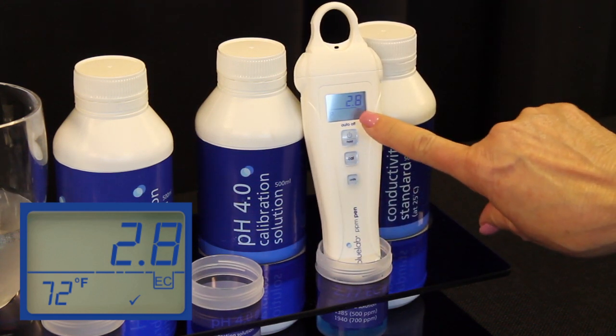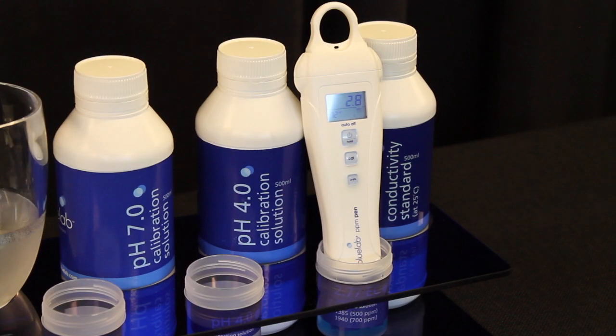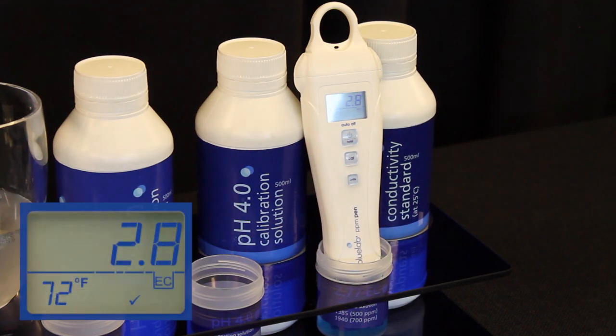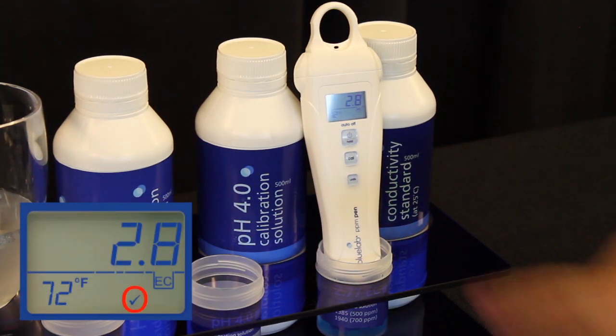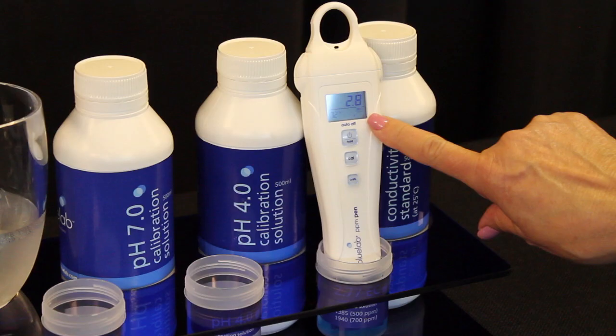You know you have a successful calibration when the check mark shows on the bottom of the screen. Now you are calibrated and ready to use. The check mark will disappear after 30 days, which means it's time to clean and calibrate your PPM pen again.